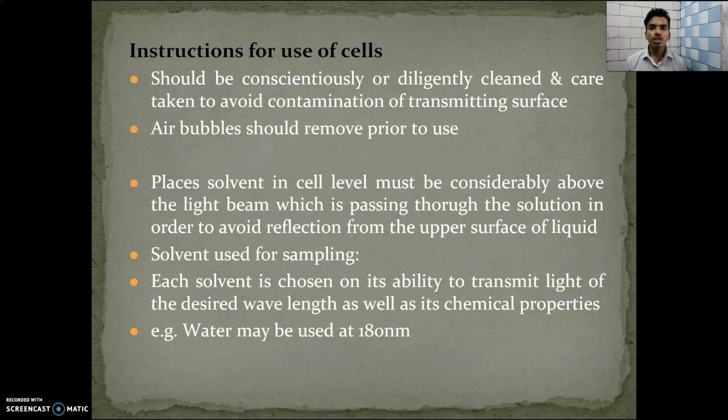Prior to use, when placing solvent in a cell, the level must be considerably above the light beam passing through the solution in order to avoid reflection from the upper surface. So a properly filled cell should be used for that purpose.